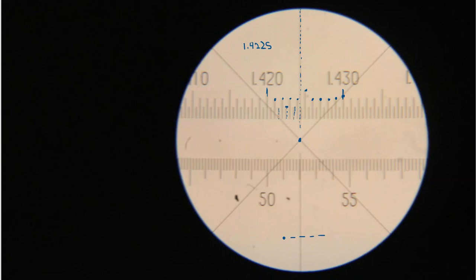So hopefully you can pause this video, maybe take a look at this meter. Let me go through and erase some of the markings so that maybe you can see that a little bit better, and then report your readout that you get for your refractive index. All right.